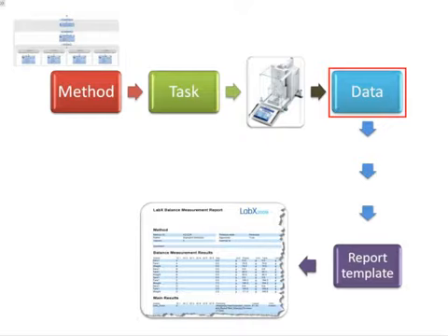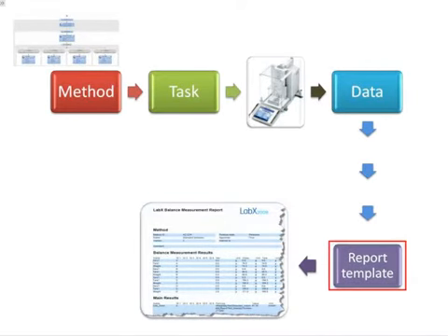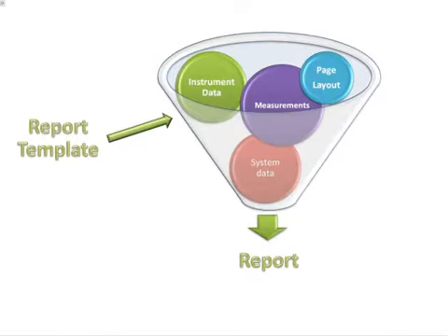Once a task is complete, the data are stored centrally at the LabX server. At any time the user may request any kind of report, based on a pre-designed report template. A report template can be described as a pre-configured page layout, combining information on which data will be gathered, and how the data will be displayed in a report. In this illustrated example, we have used a funnel as a metaphor, where numerous diverse information is collected and transformed into a specific, focused report.